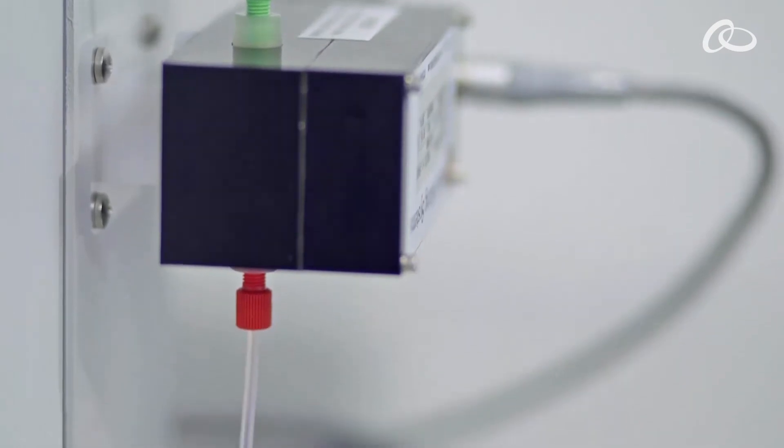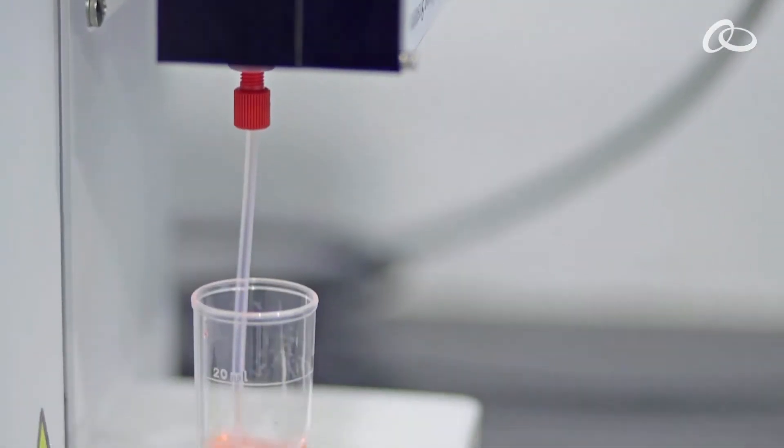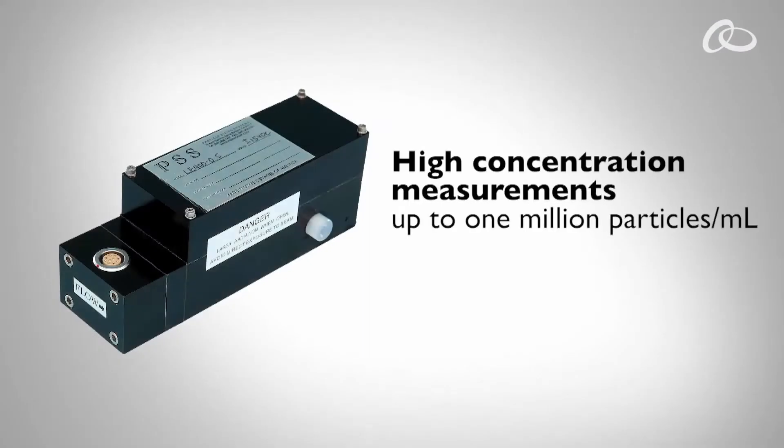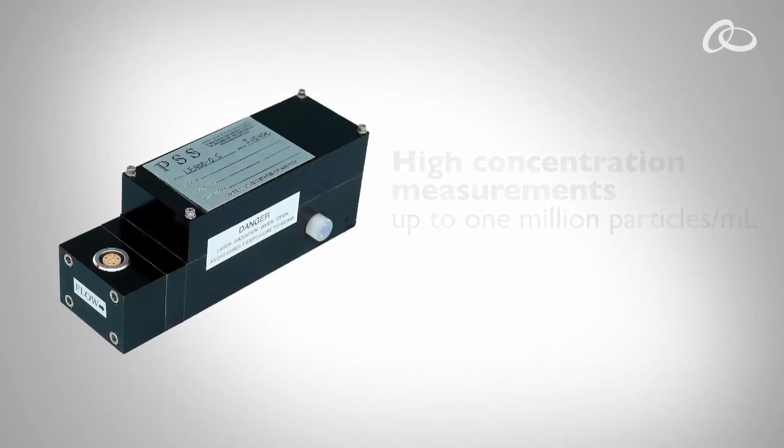Our newest generation of sensors use a focused laser beam to extend the dynamic range and allow for high concentration measurements up to one million particles per milliliter.